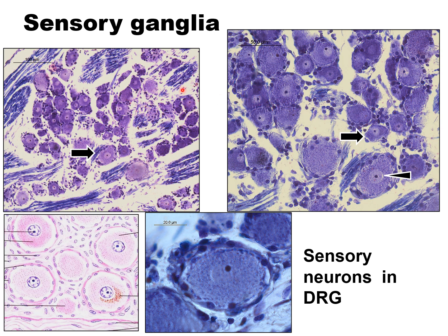Now we'll study the sensory ganglion, or the dorsal root ganglion, trigeminal ganglion. These are the sensory neurons, sensory ganglia, and the dorsal root ganglia are present just around the spinal cord. You have already seen the dorsal root ganglia. The dorsal root ganglia sections will show big neurons.